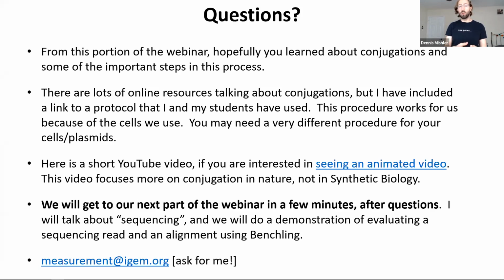So if you are working with a donor cell like E. coli, which is what most people work with, and your recipient looks phenotypically very similar to E. coli, you probably need to do that 16S sequencing. If you're working with something that looks really different though, maybe you don't, right? But I would still recommend it because it might tell you if you have some donor cell contamination. So that's the goal. Best practices basically.